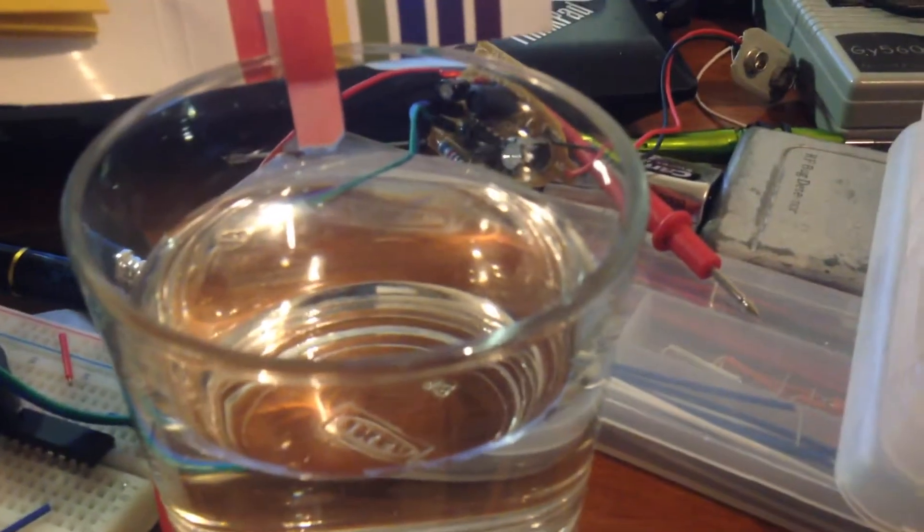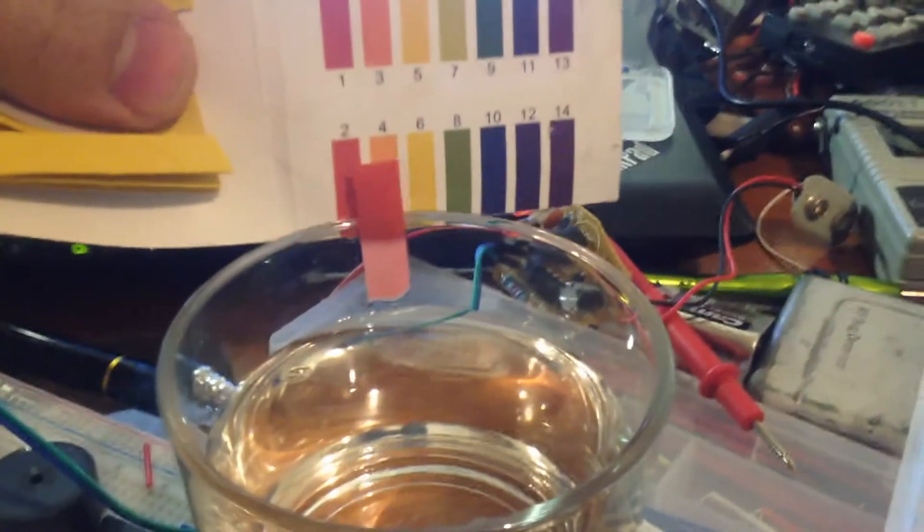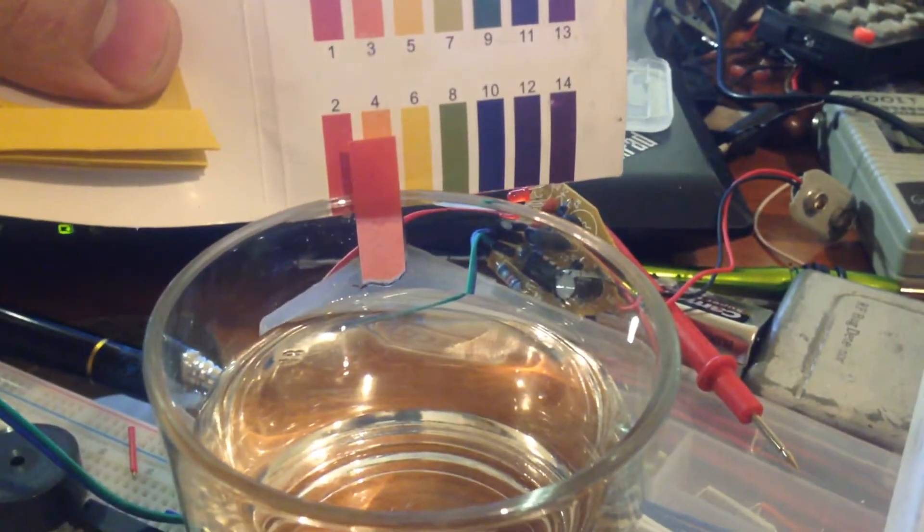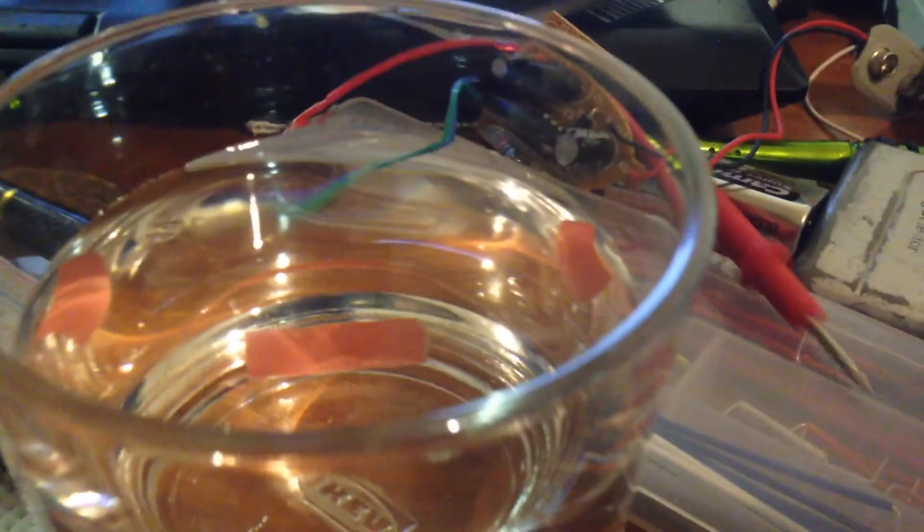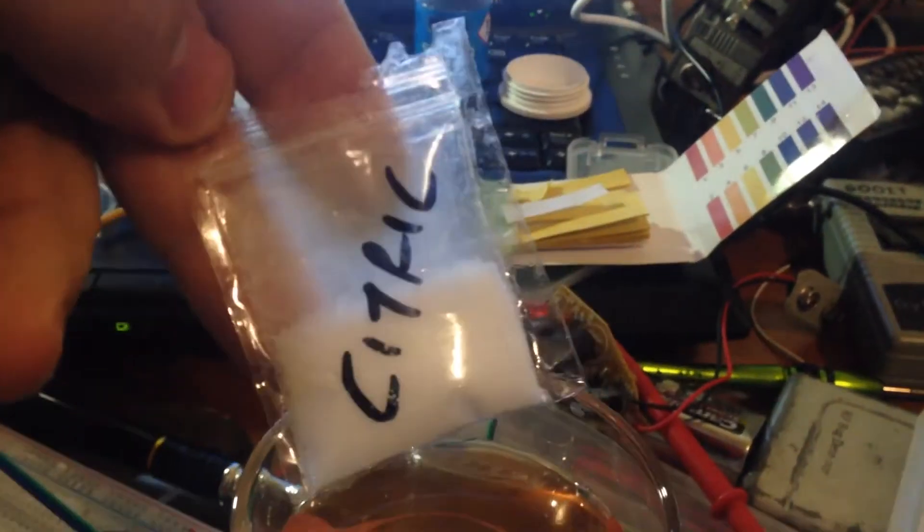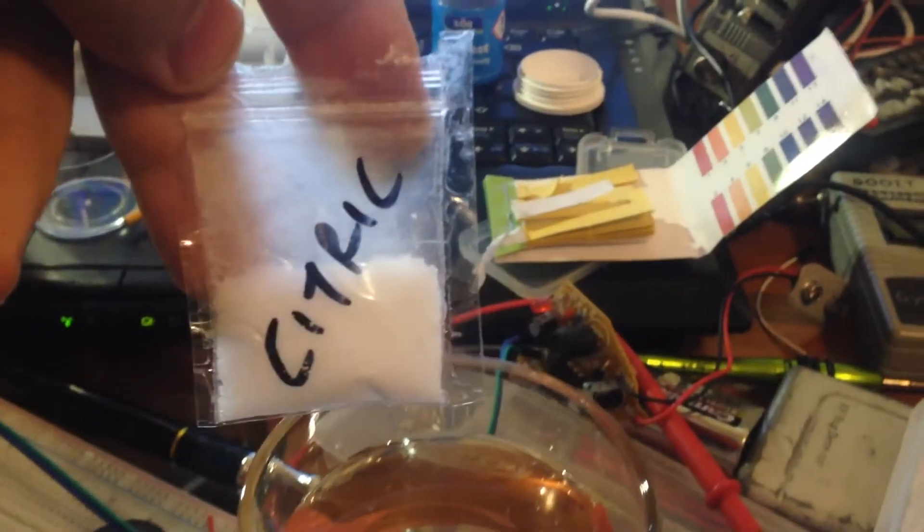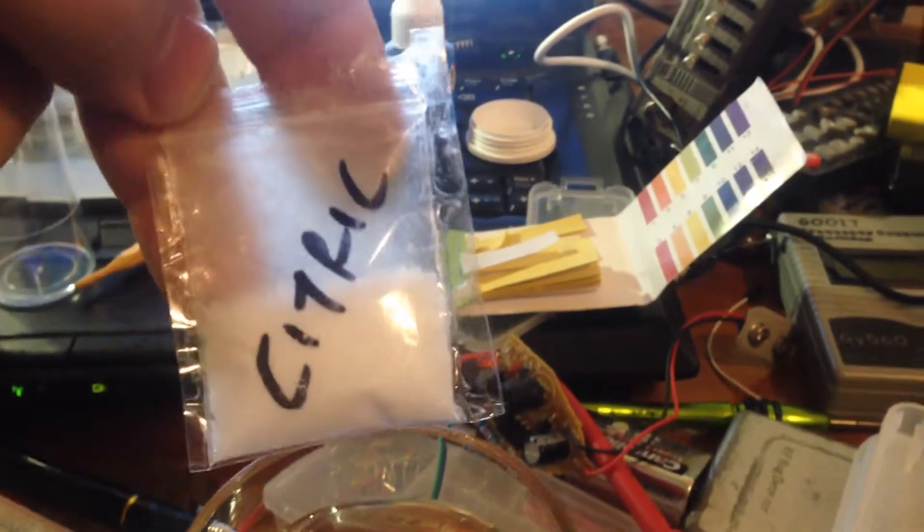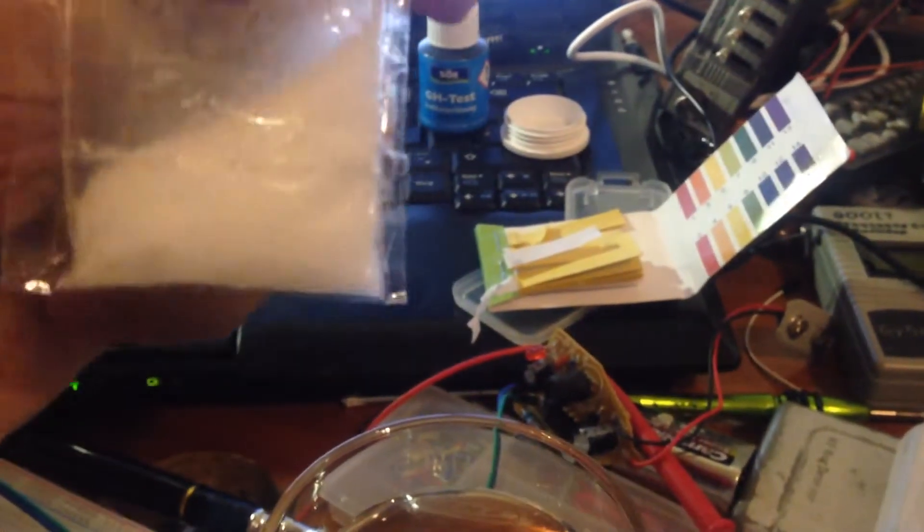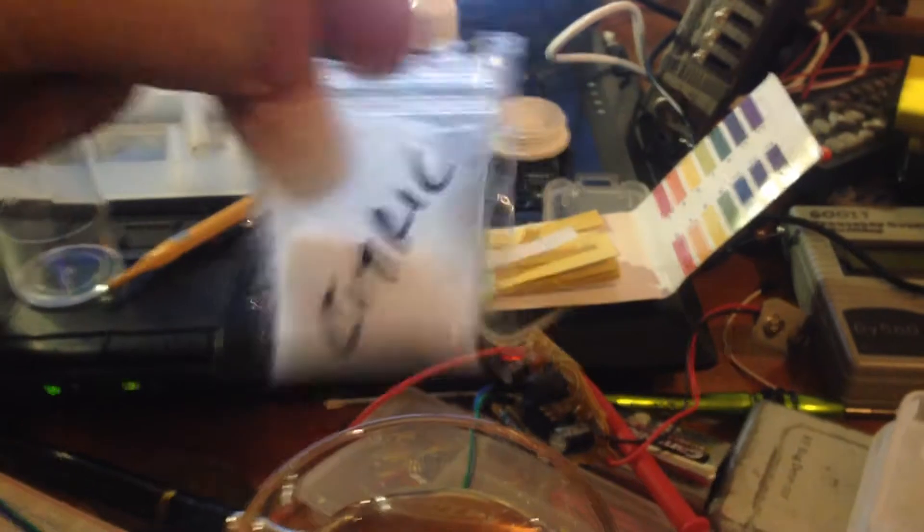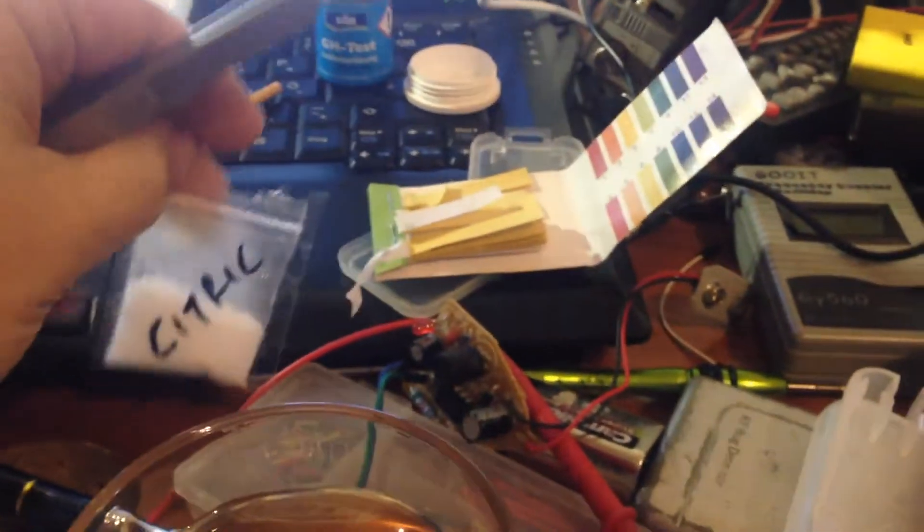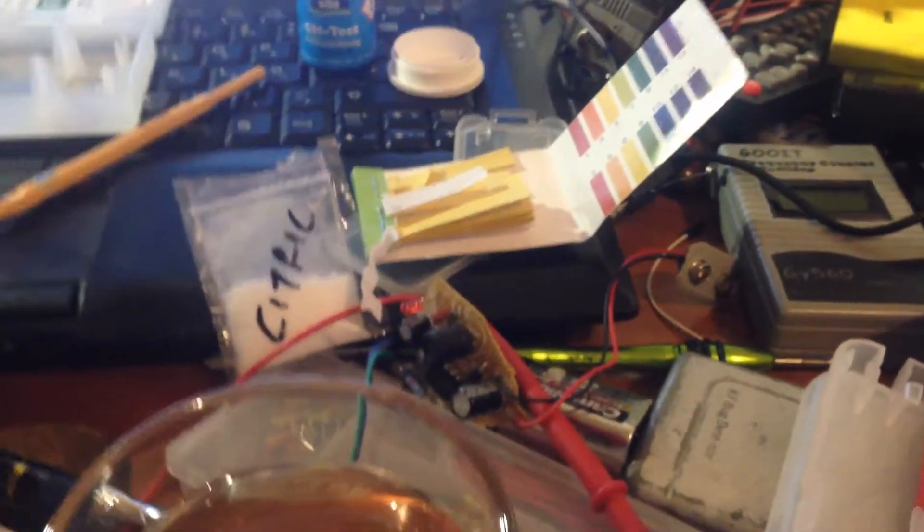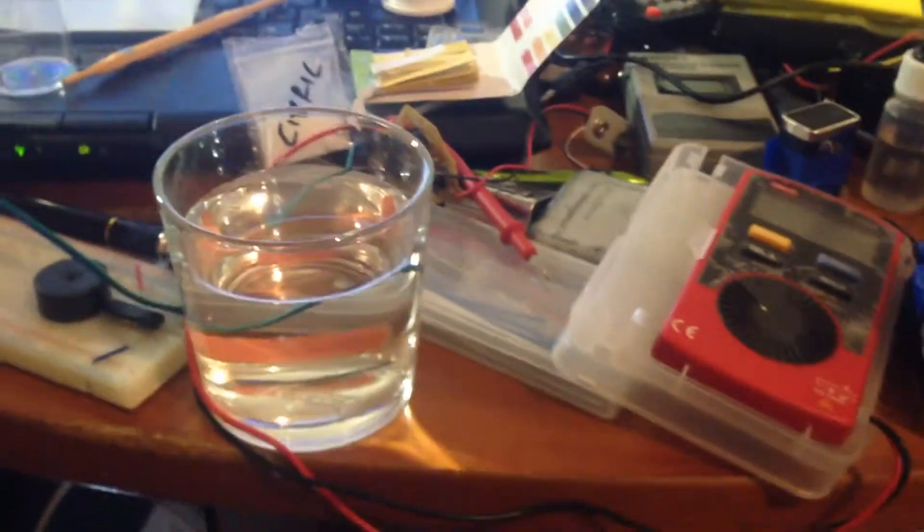This is the exact number of the sample. The citric acid I ordered online from eBay, it is exactly pure citric acid and I believe that it's good just for lab tests and for other requirements, not good.